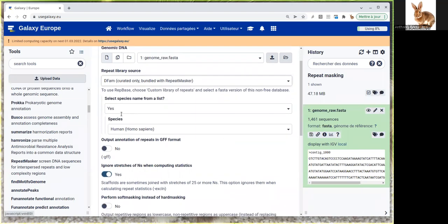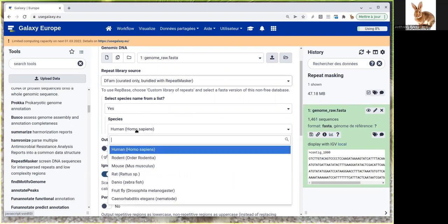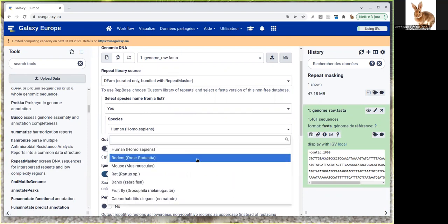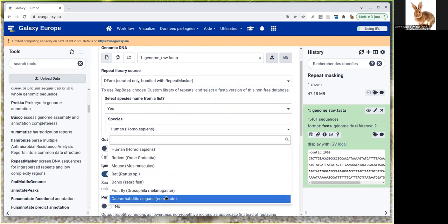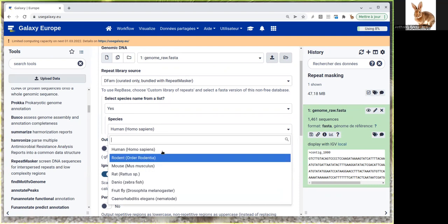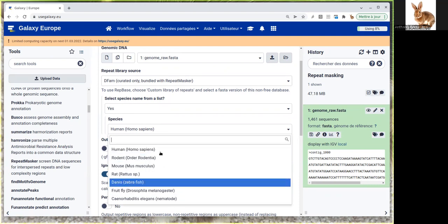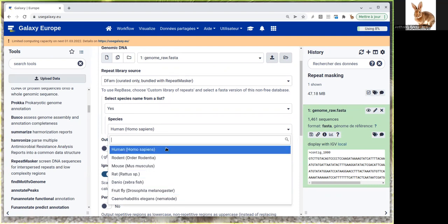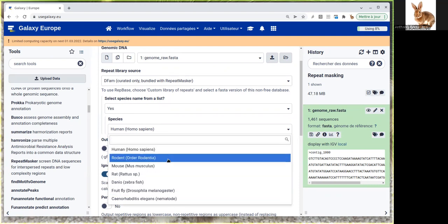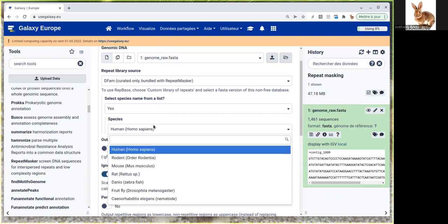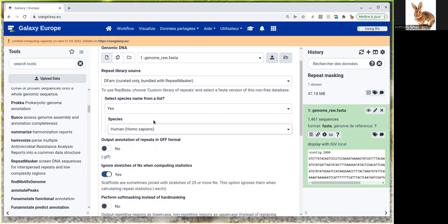We have to select a species from the list displayed below. As you can see, there's no Mucor mucedo species in this list because it's a general database. So we're going to leave the default, which is human.